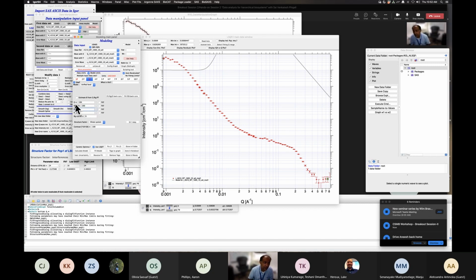So the first two terms are for the Guinier, that's the scaling for the Guinier, and the RG, the size of the Guinier. RG should be about, let's say 100, maybe more, 100 to 300. Okay, and then that should also be a bit high because this is 1,000, whereas the B should be much lower. So that's where we need to get that B down, because that's the power law slope 4. We need to get that down.